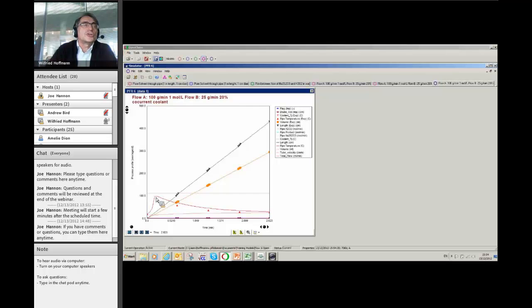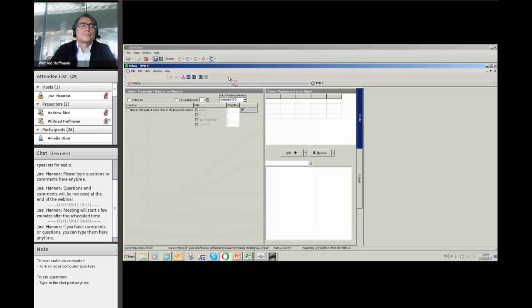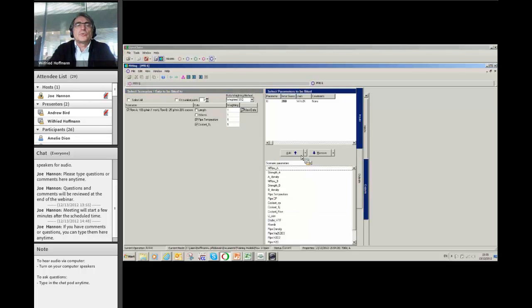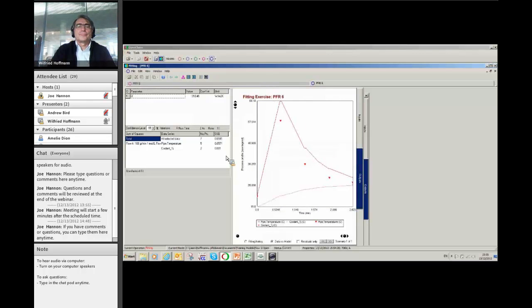That is the calculation with our assume 200 watt per square meter Kelvin heat transfer. These are the data point. And you see exactly where the data points read. They are exactly in between the connectors here. So that is a map. And what we need to do in the standard way is nobody can use this for fitting. So we use open in fitting, get this flow. We don't need to fit the length, the volume, what we can fit at the pipe temperature and probably the coolant if we like. And so let's see, we want to get the U that is what we want to change. And we can do. And you can see the fitting works without any problems.